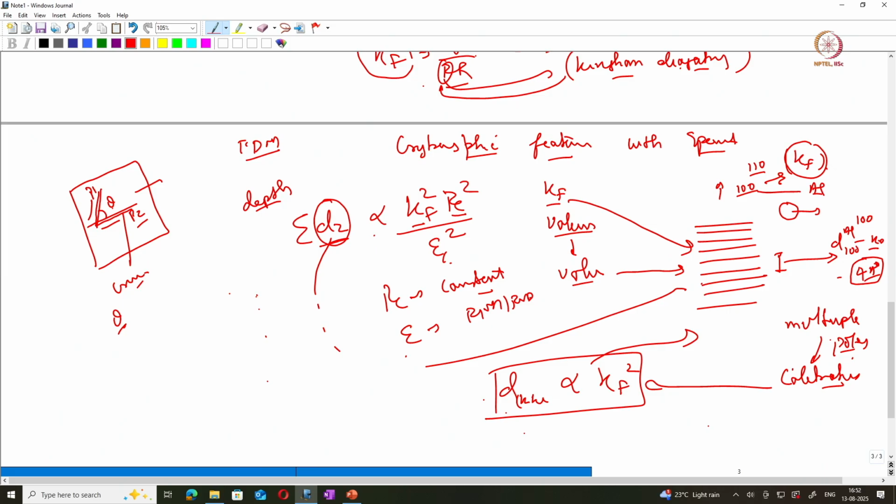Okay, so usually, if there is an error, this is very easy for pure elements or very dilute alloys. But if you have very high solute content alloys or multi-component alloys, getting poles on the FDM field desorption images is very difficult.